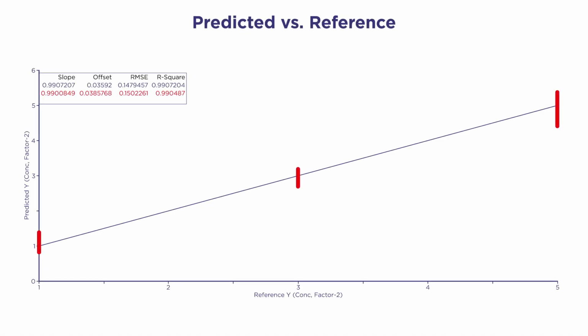One of the main outputs of the PLS model is the plot of predicted versus reference. In this graph, it's possible to see how the PLS model estimates the amount of talc, comparing the predictions done by the model with the reference values determined in the lab and reported on the x-axis. In this case, the correlation between the NIR spectra and the talc level is very high, allowing to obtain a model characterized by a very low error. It means that when this PLS model is applied for predicting the content of talc in further batches, it will be possible to obtain very accurate estimations affected by a not significant error.